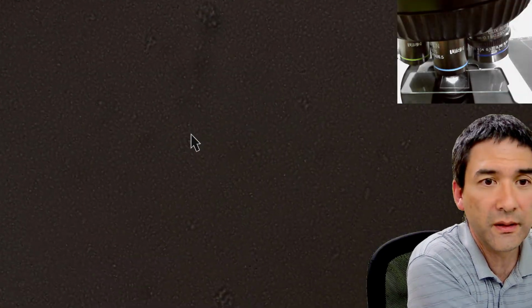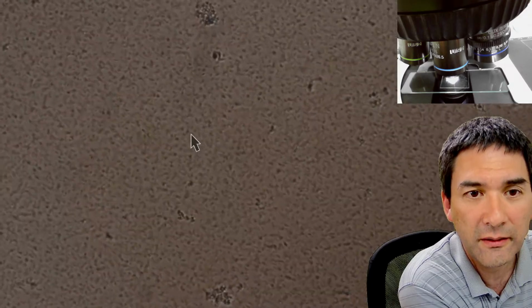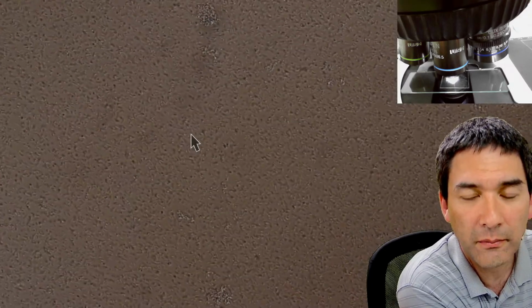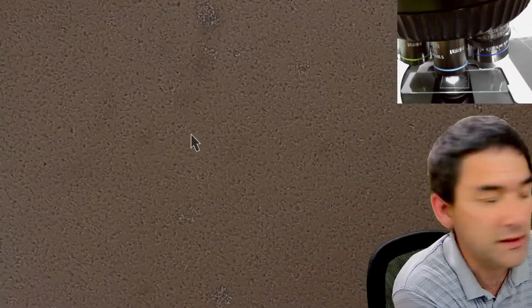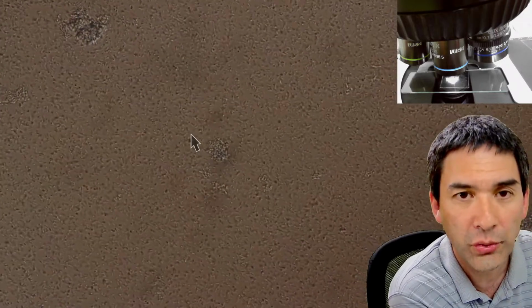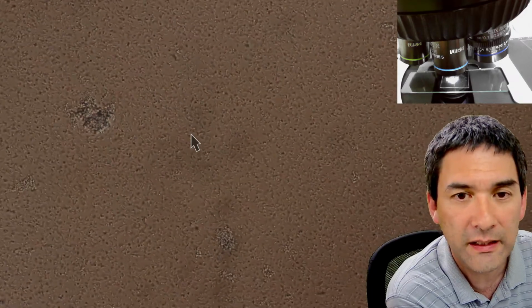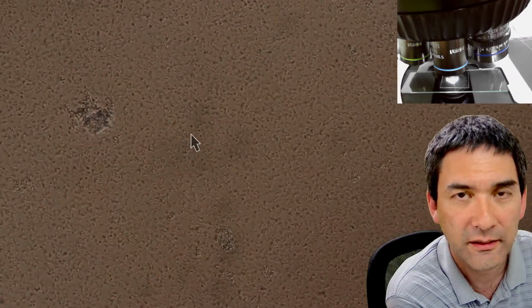40 times. Yeah, the bacterial density is quite high. And you might be a little bit disappointed. At least I hope that you're disappointed, because the purpose is to actually show you how much better it will look like after you've dried it and heat fixed it and stained it. That's actually the whole purpose.